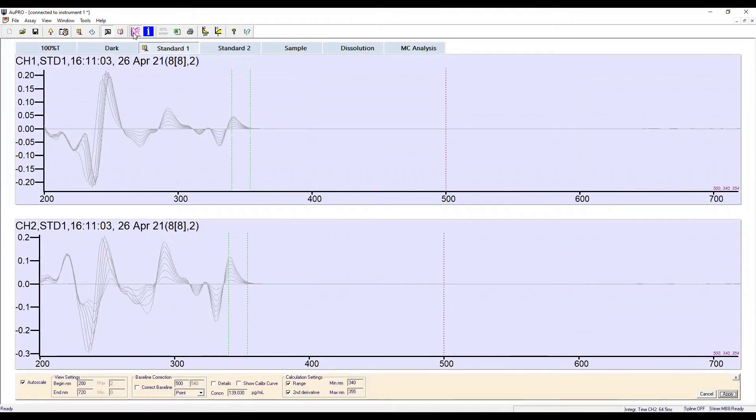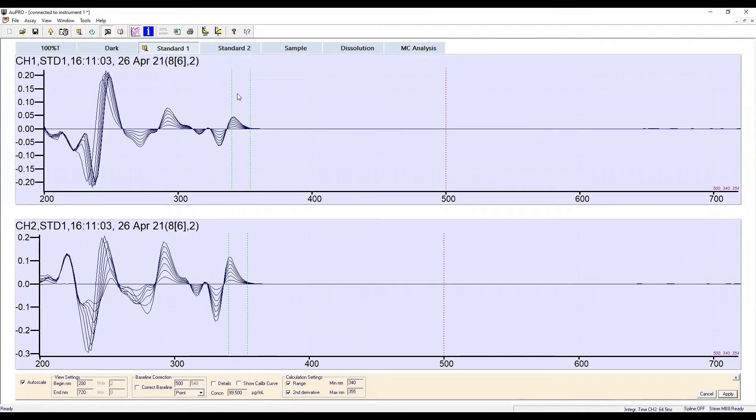Second derivative spectroscopy is used to combat any potential turbidity in the media, and appropriate wavelength range is selected.